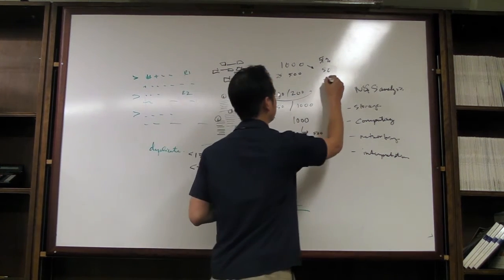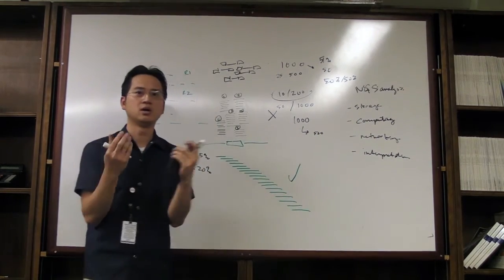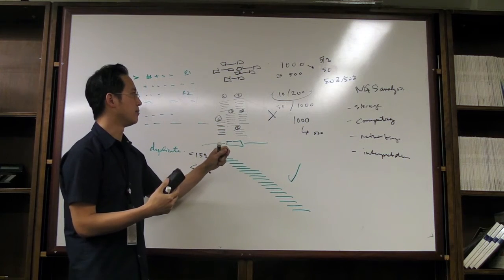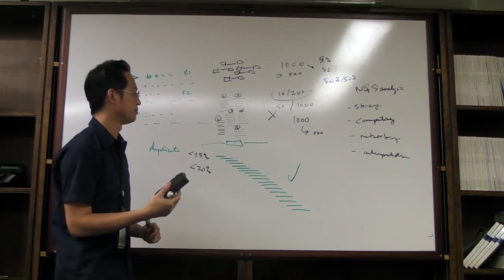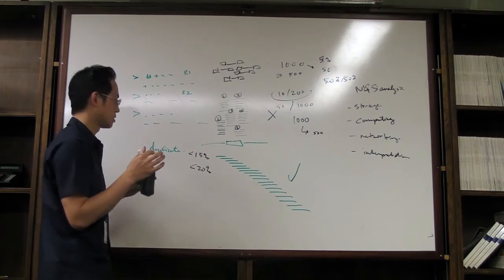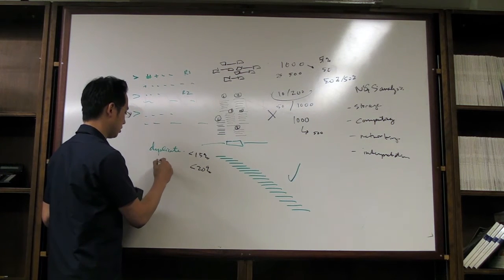You have 50%, right? 50%. It goes back to the first lecture about sampling and germline mutations versus cancer. But still, it'd be nice to maintain complexity anyways for germline. And then duplication rate is also a factor that depends on other things. It depends on how you shear.